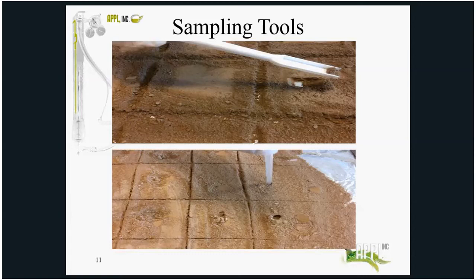Taking replicates, if you take a sample and take a replicate of it, you in essence take a triplicate from different systematic random locations across the entire spread out sample, will provide documentation whether the subsampling was reasonably representative or not. We use the %RSD to make that determination.